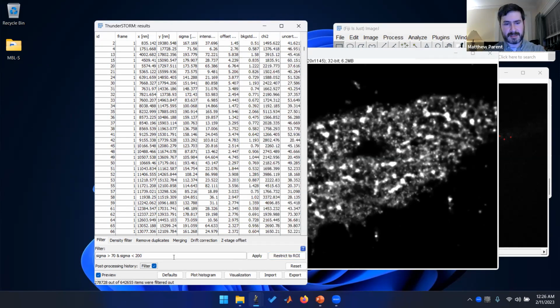And you can just keep adding to this list. I mean, if I wanted to look at just the molecules that have pretty good uncertainties, I could look at uncertainty, oops, and uncertainty less than, let's say, 100.